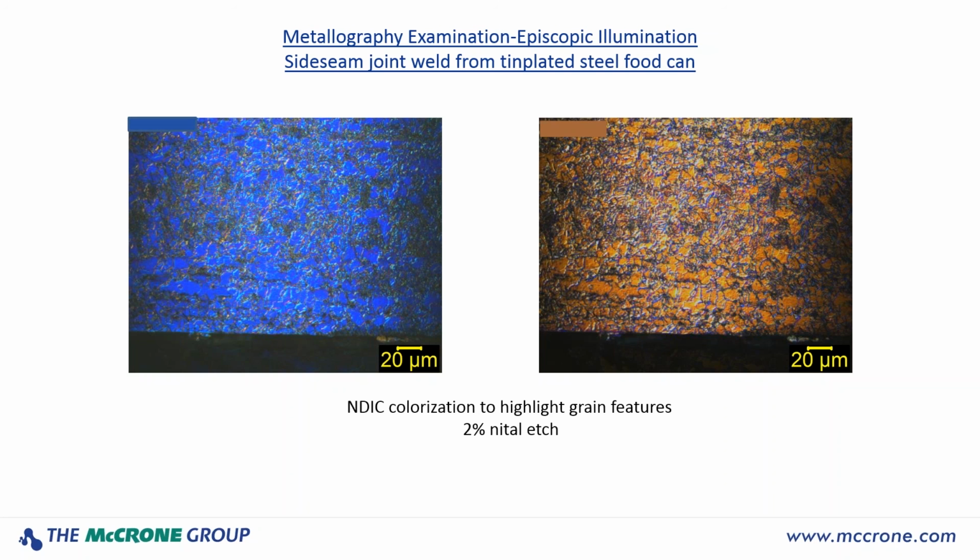There's a dark kind of webbing type net structures interwoven in there amongst the flatter grains in the sample. So here you can take these digital images and put them into some image analysis software, and perhaps do some analysis for percent area coverage of the phase that's represented by the web-like material, something like that.